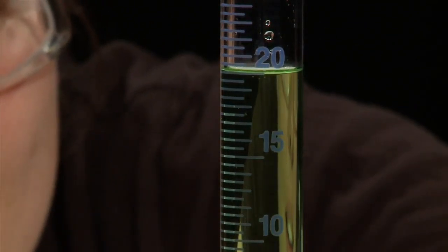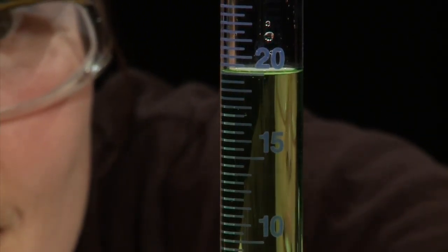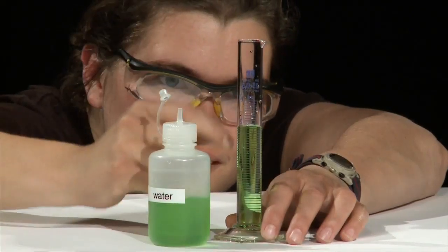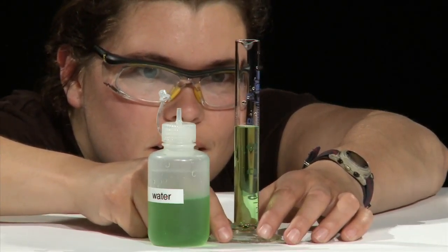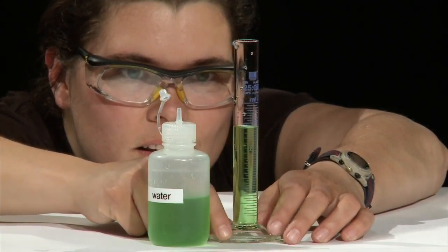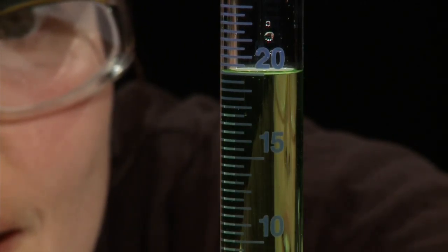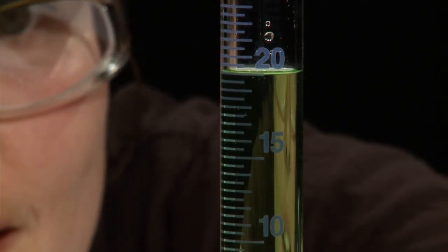Notice how the surface of the water is curved. The curve is known as a meniscus. In order to accurately measure out 20 milliliters, you must ensure the bottom edge of the meniscus is touching the 20 milliliter line.